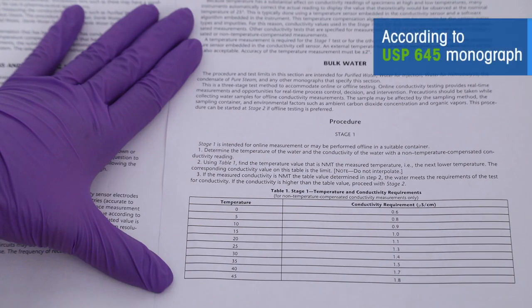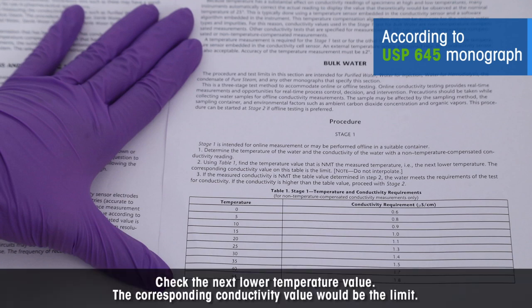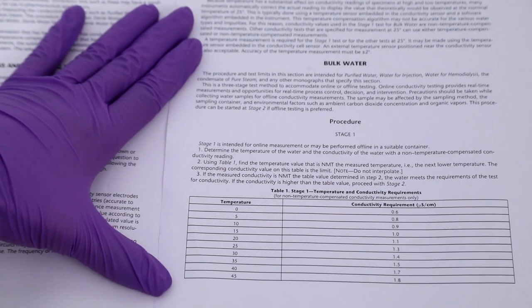While comparing, care must be taken that temperature value in the table is not more than the measured temperature, that is, check the next lower temperature value. The corresponding conductivity value would be the limit. If the result is not more than the table value, then the water meets the requirements.